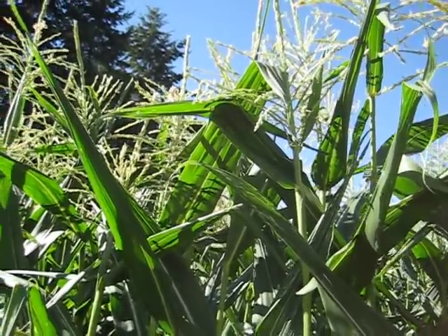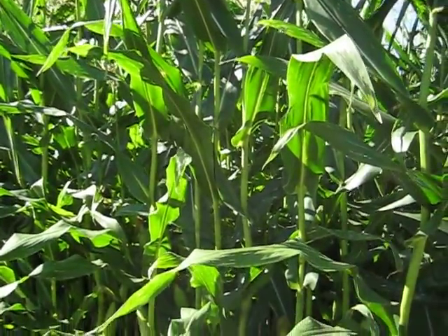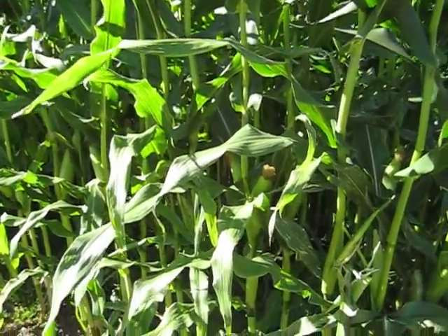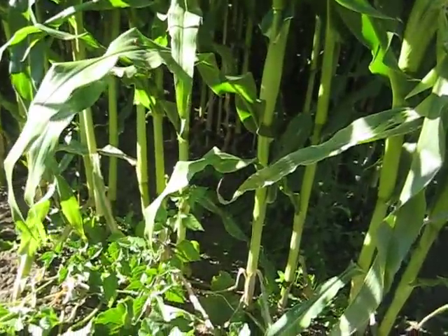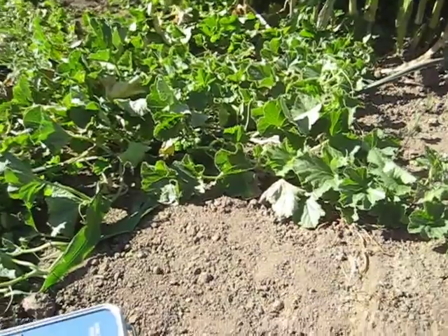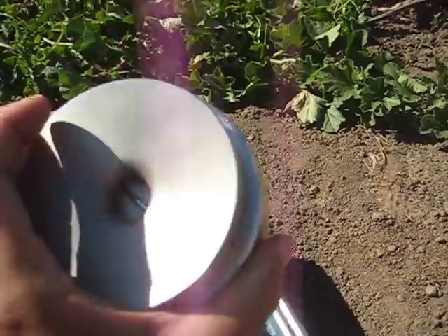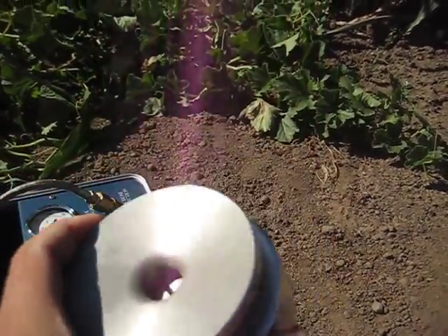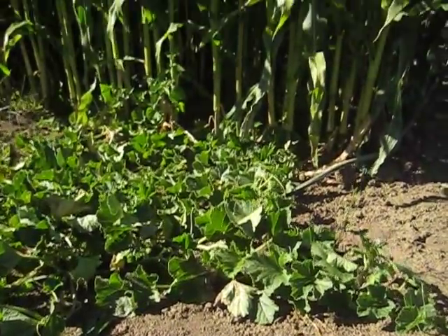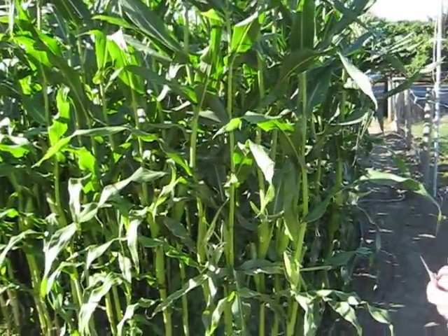We're measuring corn with the pressure chamber today, and this is a pretty mature patch right here. Early season we can probably just take a small sample from down at the base — that might be just about three quarters of an inch wide, which would fit in the grass seal real easily. But as the corn matures and becomes as large as it is in this patch, we need to do a slightly different method we're about ready to show you.